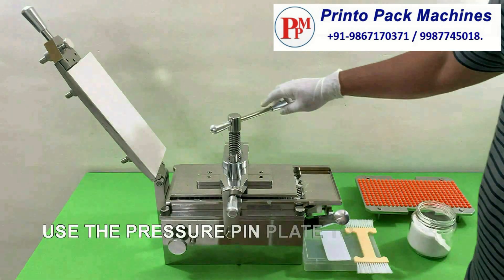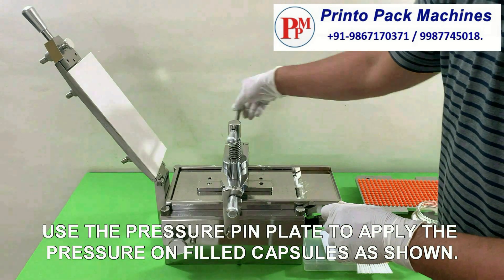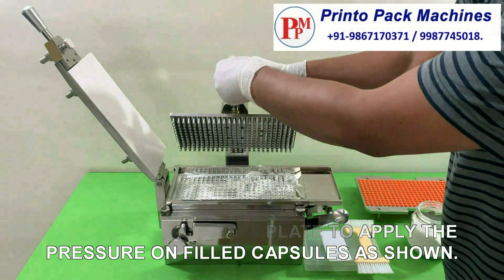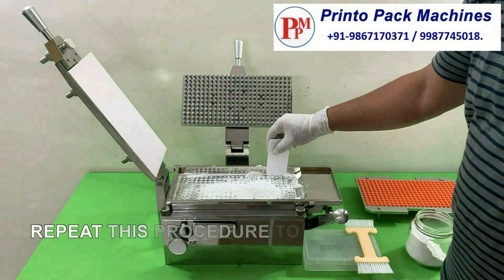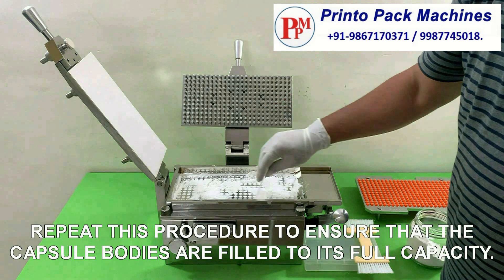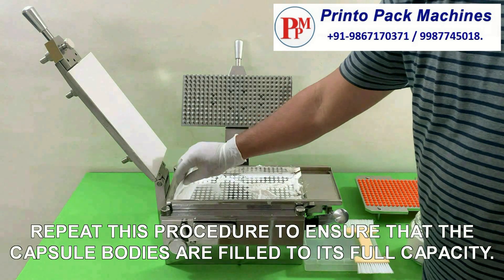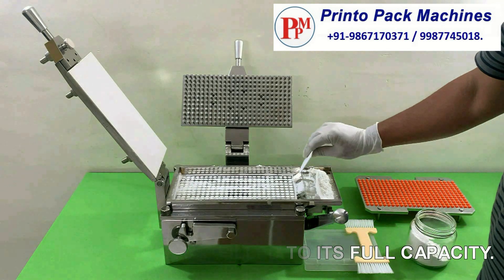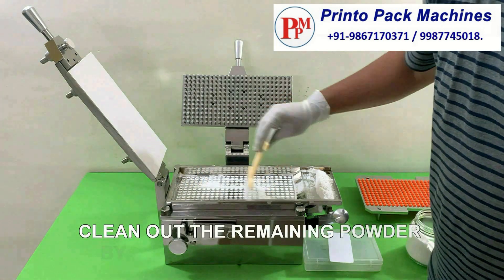Use the pressure pin plate to apply pressure on the filled capsules as shown. Repeat this procedure to ensure that the capsule bodies are filled to their full capacity. Clean out the remaining powder by using the cleaning brush.